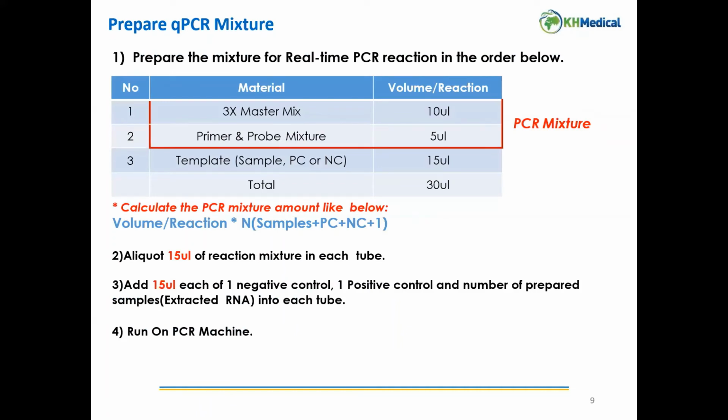This shows you how to prepare the master mix, but basically what I just described. So you can make your aliquots early enough, because as you run the prep machine, you'll be preparing to do your RT-PCR. So in order to save time, depending on the volume of the machine you're using and the number of samples you're getting, this helps you to do your aliquots early enough so that you can move faster when you are working in the lab.